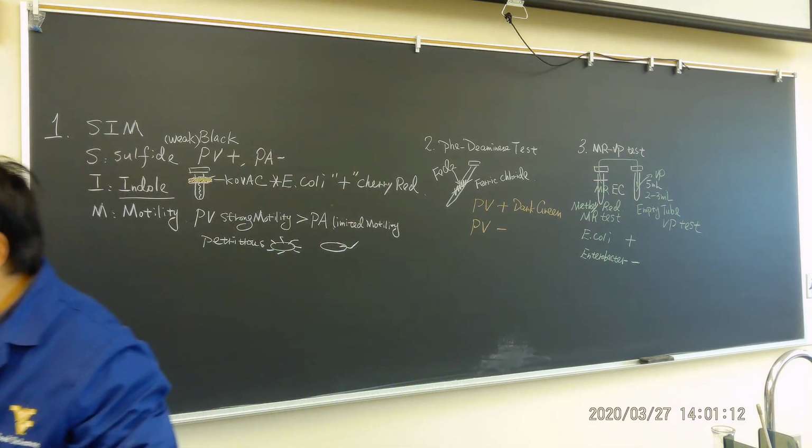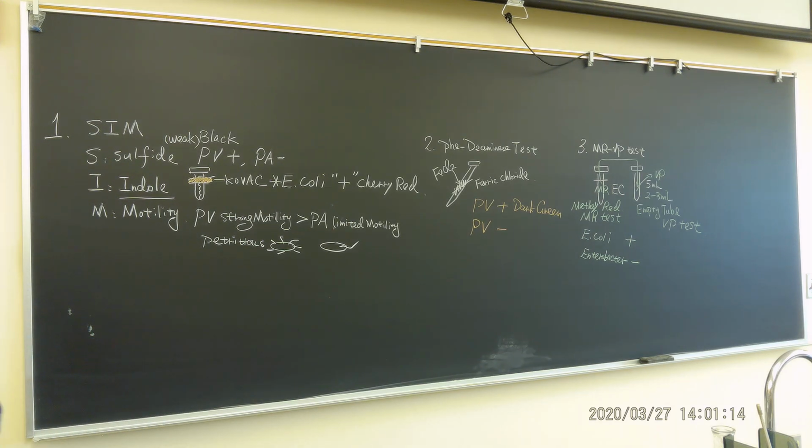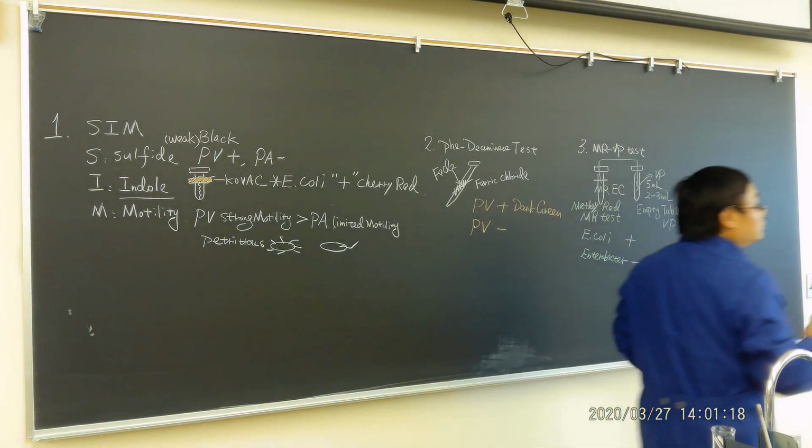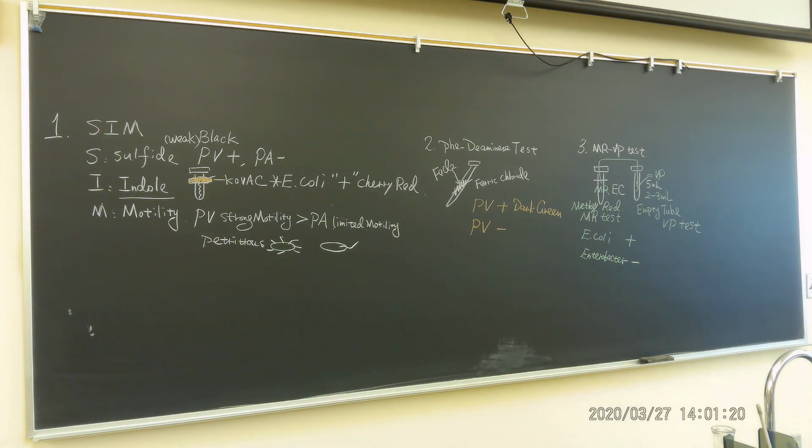So Rachel, you go ahead to add for them. Reagent B, I'll add reagent A. Okay? Now, let me have your tube, whichever tube you label as VP. Now you have to shake a little. Shake a little. You may not see anything right now.